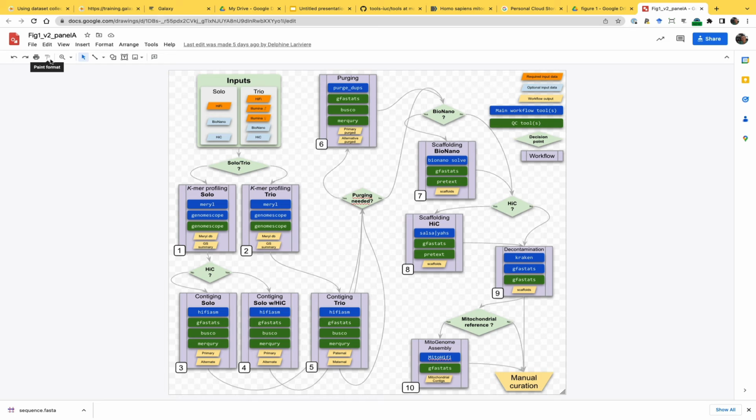But it's still remarkably efficient, because you could not assemble human-sized genomes on a single node 3-4 years ago. Now it's possible because of the long reads. Before, you needed a big, large shared memory cluster. So this is interesting for the giraffe work and for what we're doing with Drosophila. Anybody who does large genome assembly, you can talk to me later if you're interested.